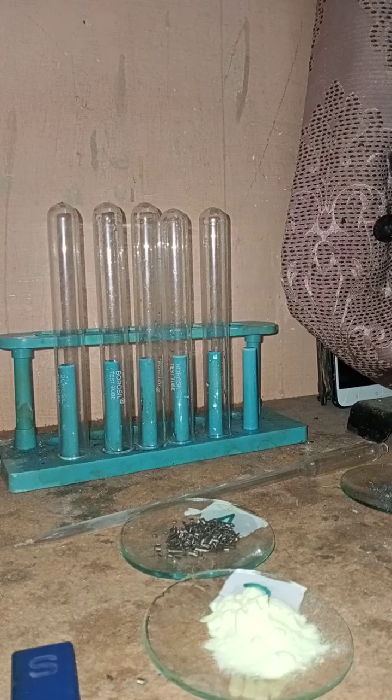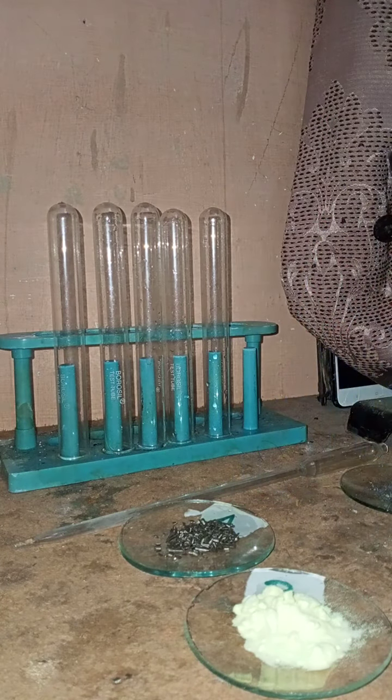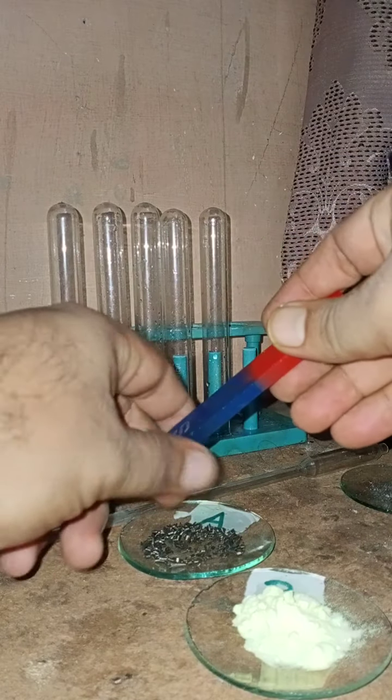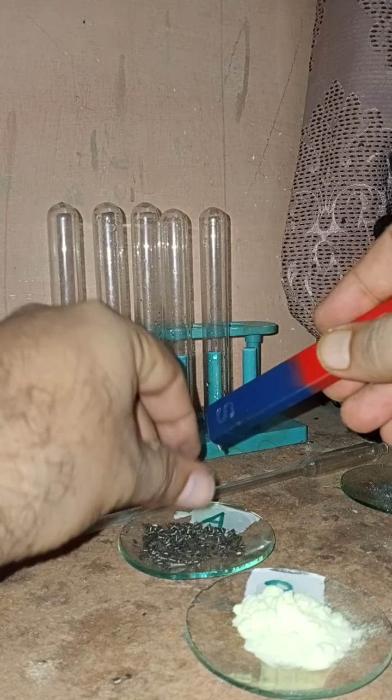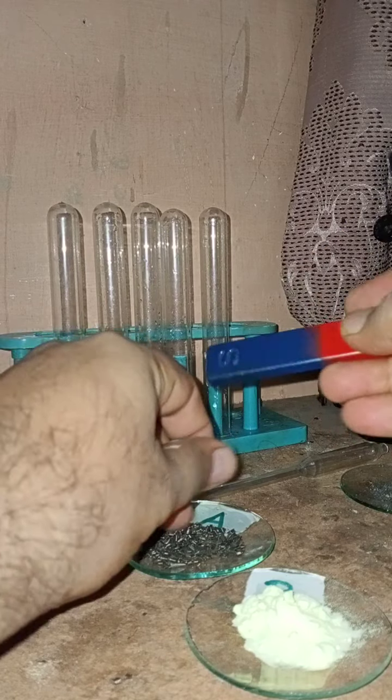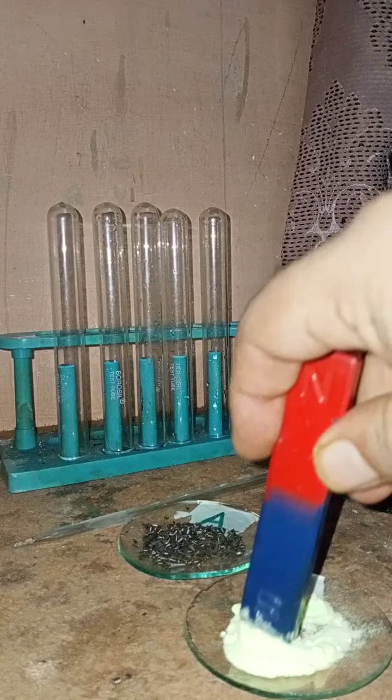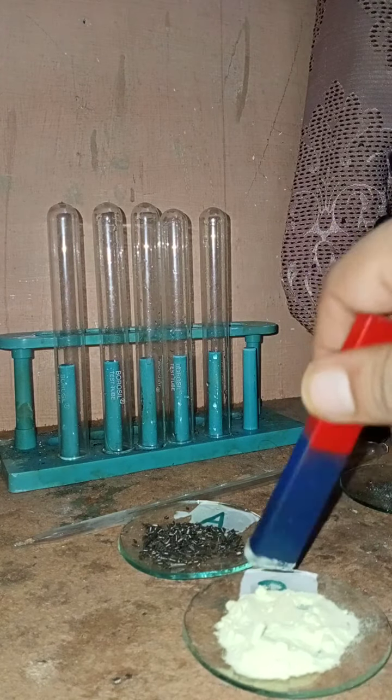First of all, we should use this magnet to see what happens when we move this magnet into the iron fillings. You can see that the iron fillings are attracted by the magnet. But if we pass the same magnet with the sulfur powder, it is not attracted by the magnet.